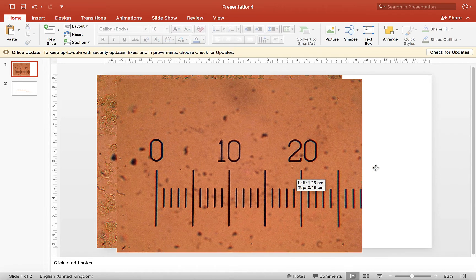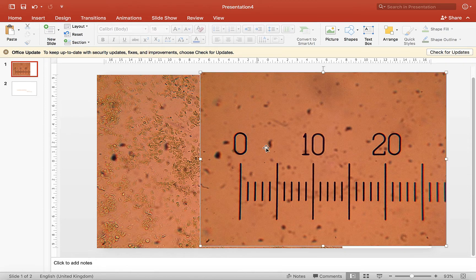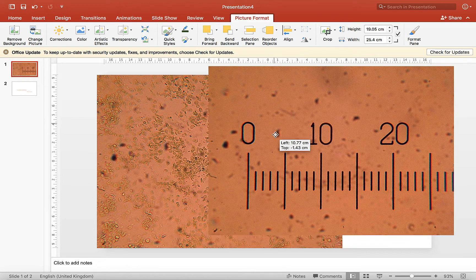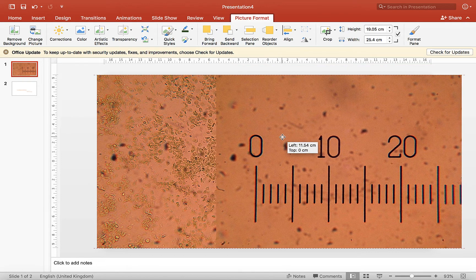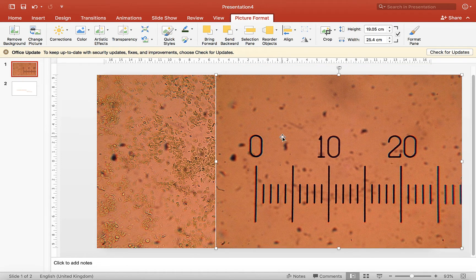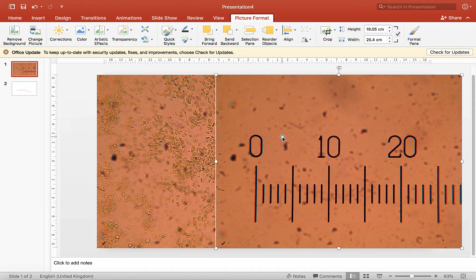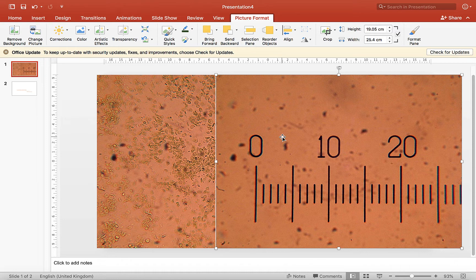So these were both taken with a times 40 objective lens, so remembering that the eyepiece lens also has times 10 magnification in it, we're looking at times 400 magnification in total.